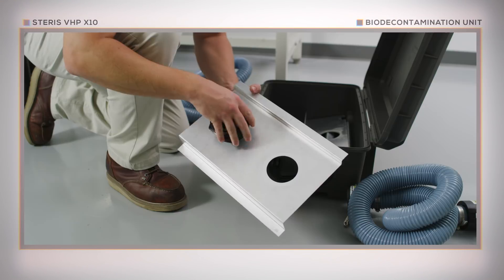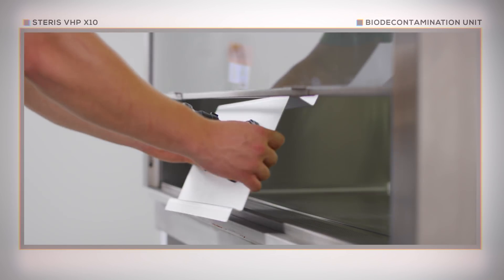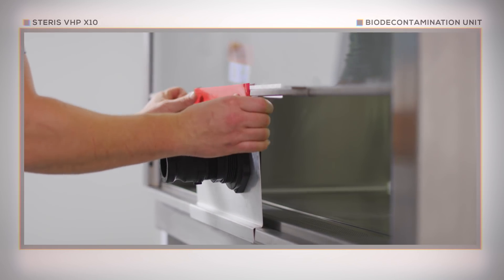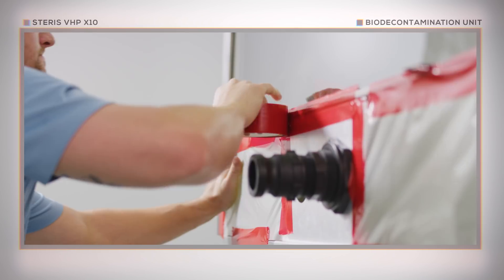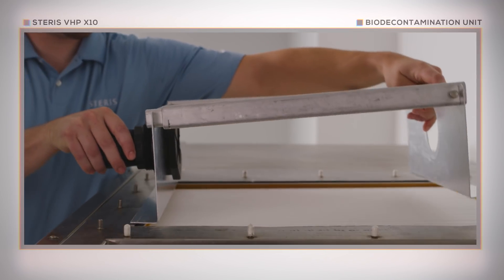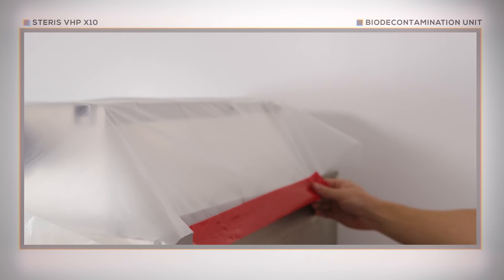Now, install the connections to the sash plate and return frame. Install the sash plate in the cabinet sash opening using tape. You may need to raise or lower the sash height depending on the cabinet type. Next, seal the remainder of the sash opening using plastic sheeting and tape. Now install the return frame on top of the cabinet exhaust filter, and seal the return frame to the top of the cabinet, again using plastic sheeting and tape.